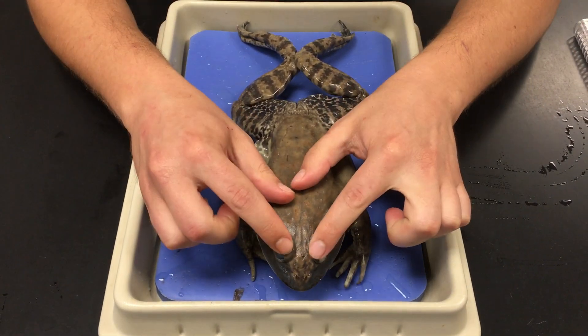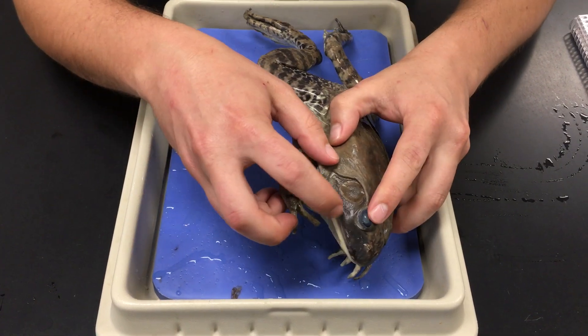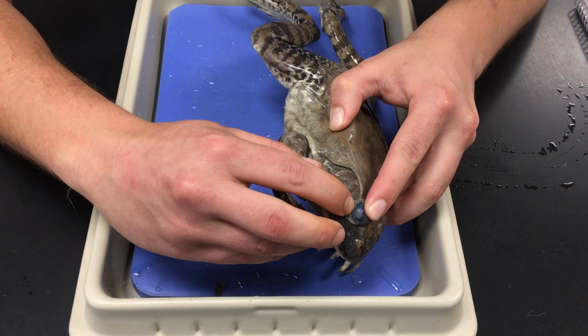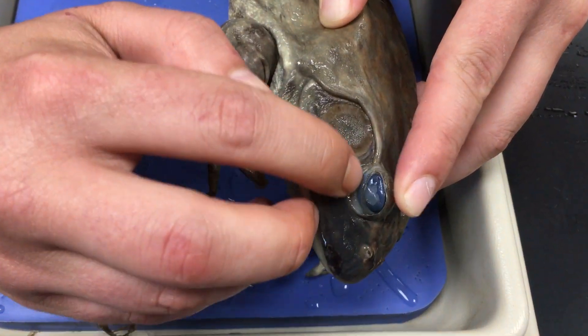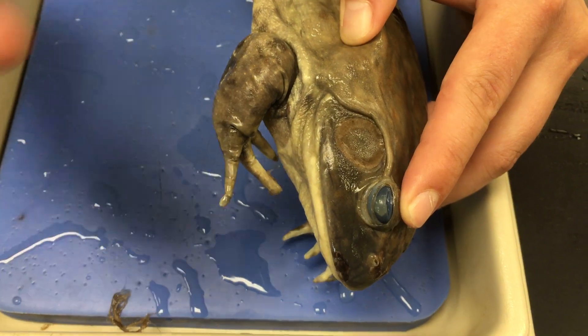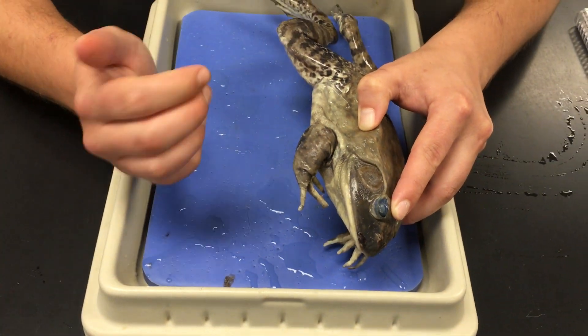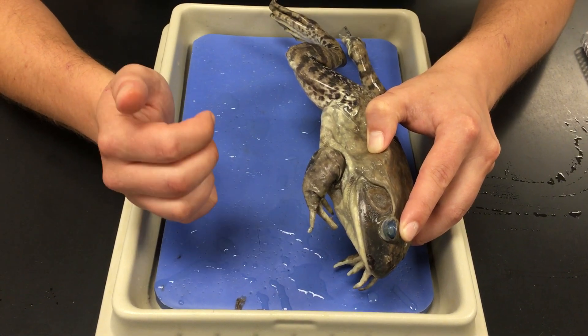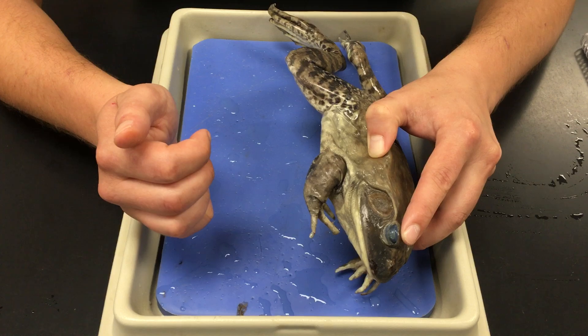First we have the eyes. The eyes are covered by a clear membrane — you can just see the edge of it along the bottom — that will move over the eyeball. They'll put this over their eyeball when they're swimming, and it still allows them to see. It's kind of like a goggle, if you will. This is called the nictitating membrane.